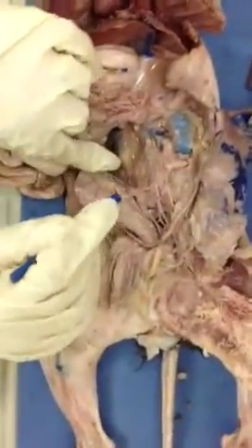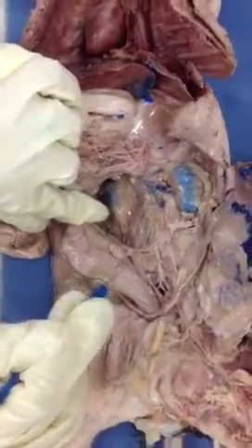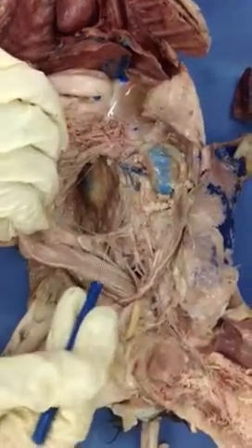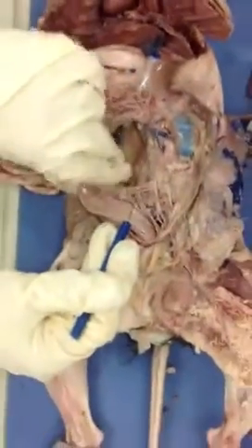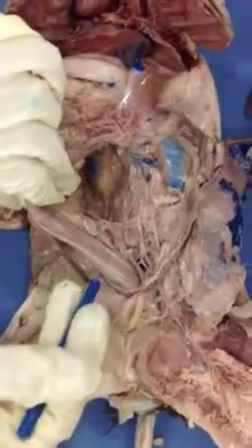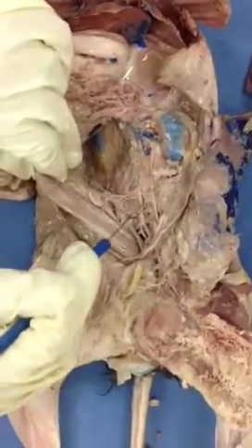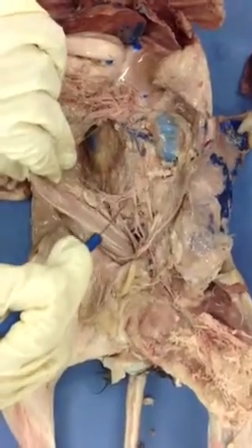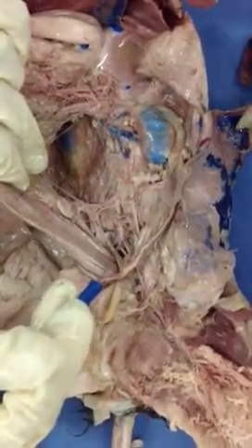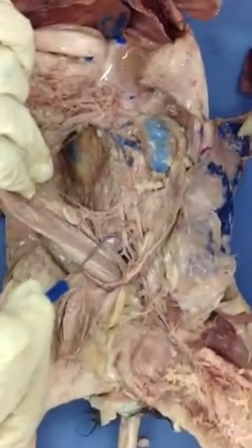Now, the next branch, I continue to follow my abdominal aorta, right? And I see another branch is coming out of it. And it's going toward this structure. So then which branch is this one, please? Inferior mesenteric. Very good. Inferior mesenteric artery, right? Because you see how it's going towards the, what's this? Bladder. Colon. Very good. Now, I noticed that after that, it's going to give me another branch that I see here. What is this branch here, please? Iliolumbar. My left iliolumbar and then my right iliolumbar.